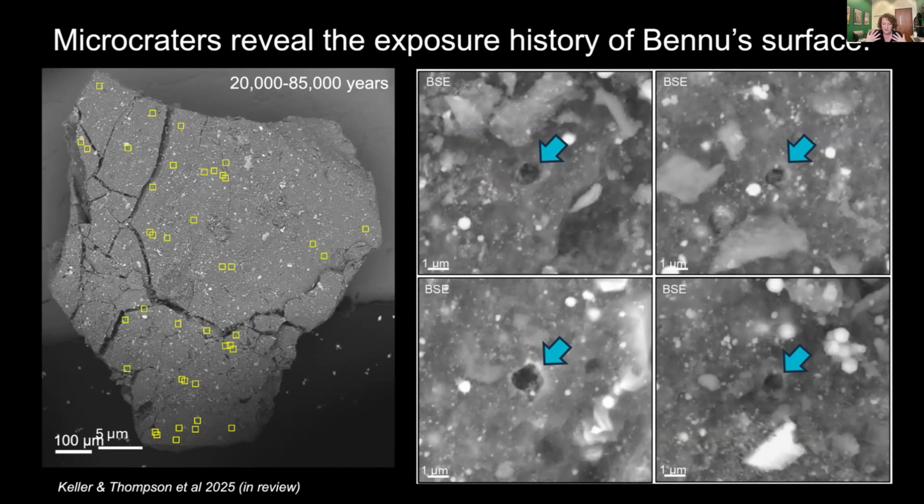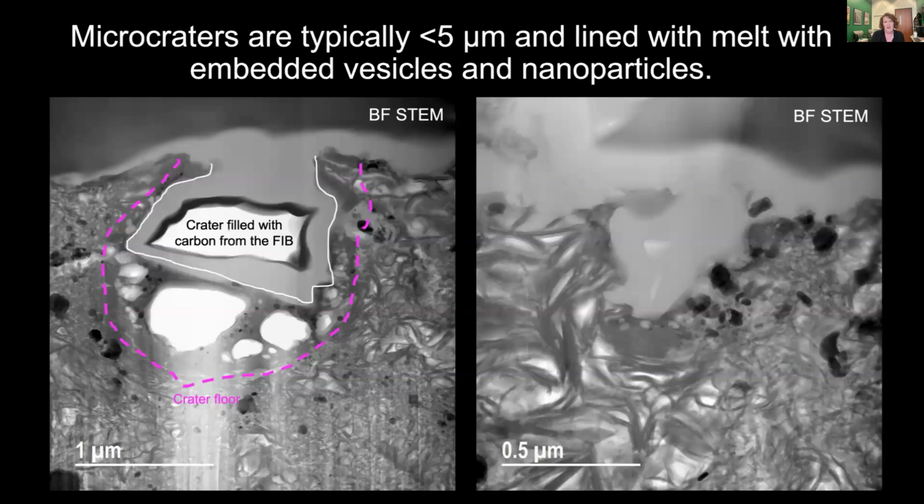Now, we wanted to see how these microcraters compared in cross-section to that one large microcrater I showed you first. So here is a TEM cross-section of 2 of those different microcraters. They're typically less than 5 microns in diameter as well as in depth. This is the cross-section. So you're looking at the surface of the grain here, and you're going into the grain interior as you move down. All of this fluffy, hairy looking material, these are phyllosilicate minerals that we see returned in the samples from asteroid Bennu. These include water as a part of their crystal structure.